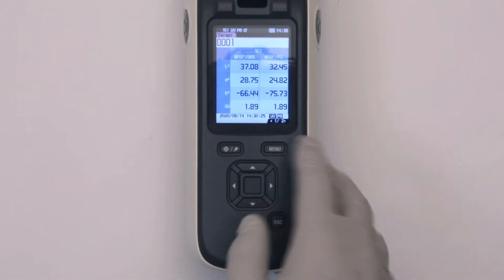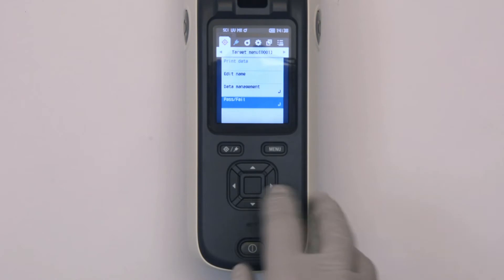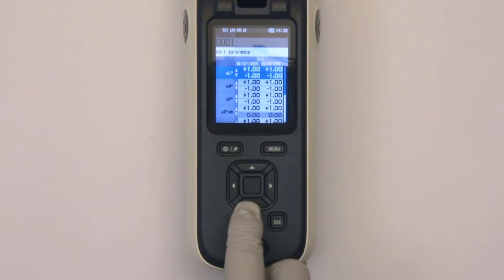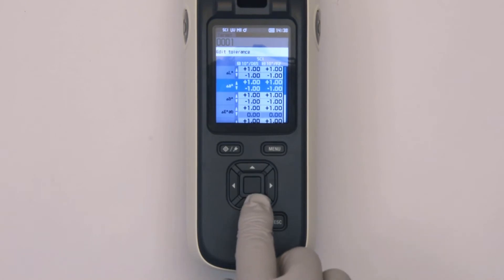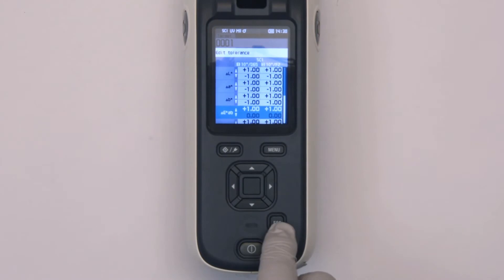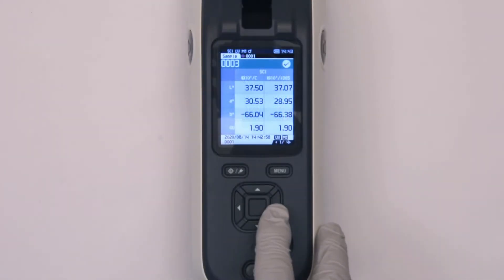The CM26DG comes with default values set for tolerances. Should you need to change these values, the easy to navigate user interface allows you to get to this screen quickly and effortlessly. At this screen, you can edit all color metric tolerances for the instrument as shown here.